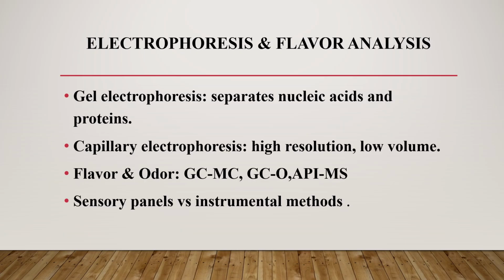Electrophoresis and flavor analysis. Electrophoresis separates molecules based on charge and size. Gel electrophoresis is used for DNA and protein analysis. SDS-PAGE separates by molecular weight. Isoelectric focusing separates by charge. Capillary electrophoresis offers higher resolution in small volumes. It's ideal for amino acids and vitamins.